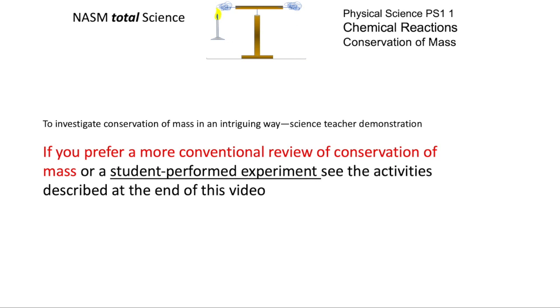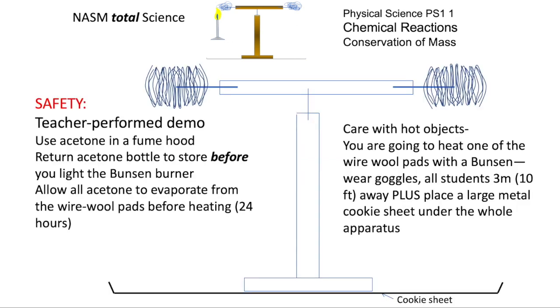So we're going to use some unusual apparatus, a setup making a balance, and a teacher-performed experiment.